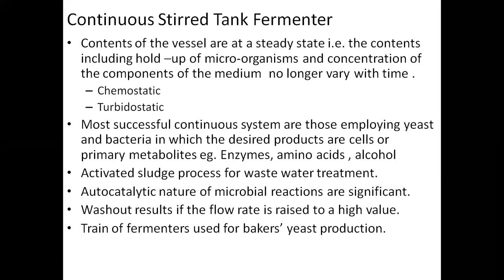The next type is the continuous stirred tank fermenter. Basically, the contents of these vessels are at steady state. That is, the contents and the concentrations of the different components of the media and also the microorganisms do not vary with time. They can be run in the chemostatic mode or the turbidostatic mode.